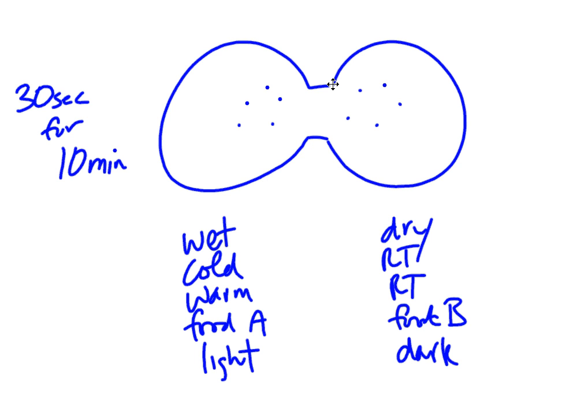Okay. Now, if you decide to go with ants or something smaller or something that moves a little faster, then you may not want to go with just counting them on the fly. It's always a good suggestion to just take a picture of it every 30 seconds. Okay, the picture will obviously have a time index, so you know which picture's in order. Not to mention in your gallery or in your visual, you'll be able to see the order in which you took the picture, so you should know which is time index 1, time index 2, all the way through.